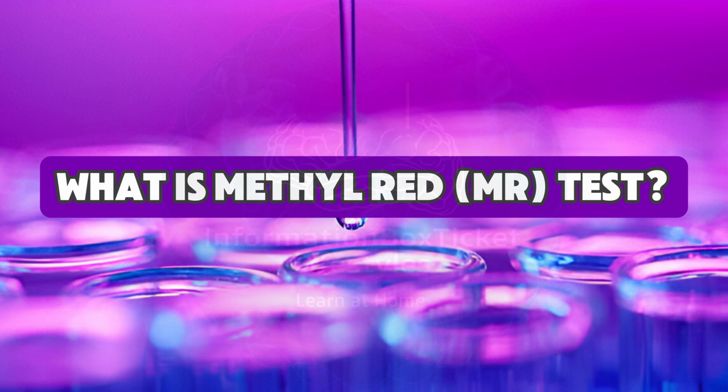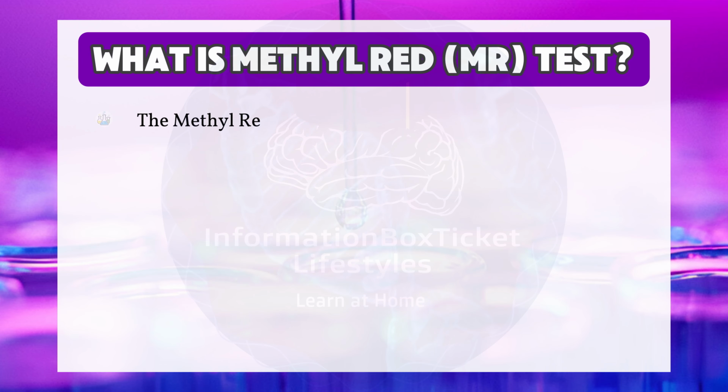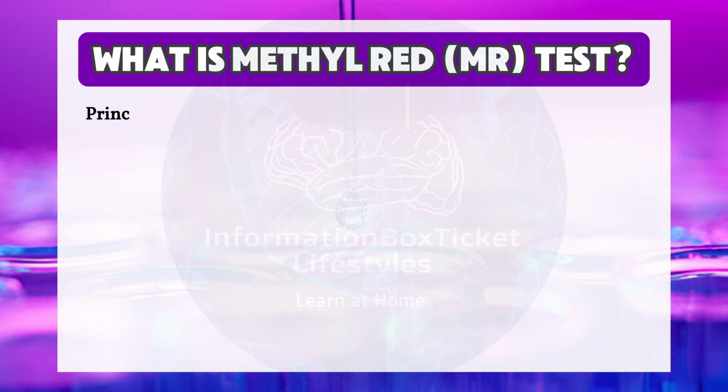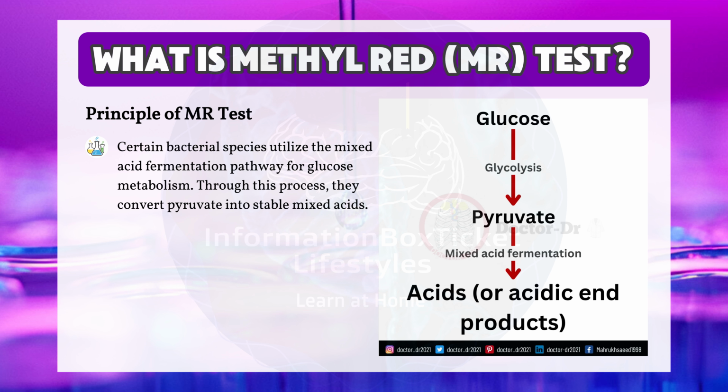What is Methyl Red, MR test? The Methyl Red, MR test, is a biochemical assay used to identify bacteria that produce stable mixed acids as end products of glucose metabolism. It is represented by the letter M in the IMViC series. Principle of MR test: certain bacterial species utilize the mixed acid fermentation pathway for glucose metabolism. Through this process, they convert pyruvate into stable mixed acids.